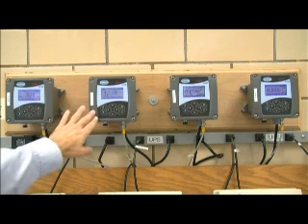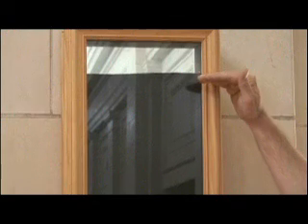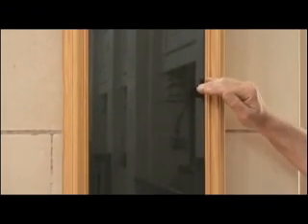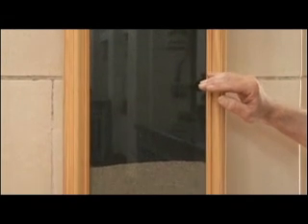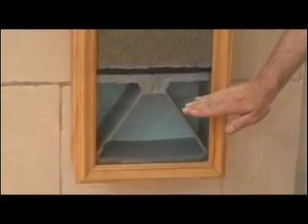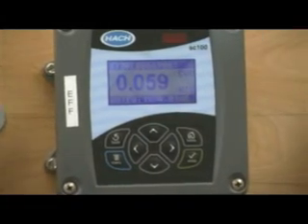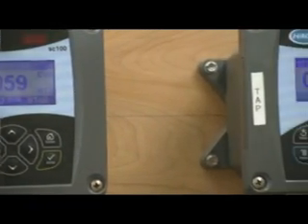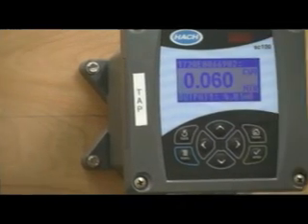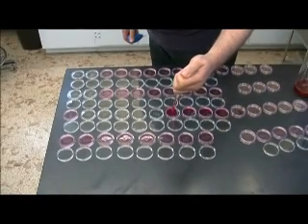After the water leaves the settling basins, it goes through all of our filters. We have 24 sand filters. We are a conventional treatment process using conventional sand and anthracite, which is coal, filtration processes. You can see that at that point, the effluent leaving the filters is between 0.059 and 0.060, and then the very last one on your right is the actual tap sample, and it again is identical to the effluent at 0.060 NTUs.